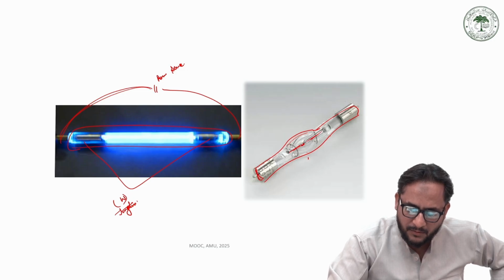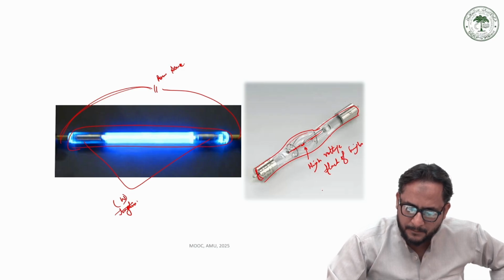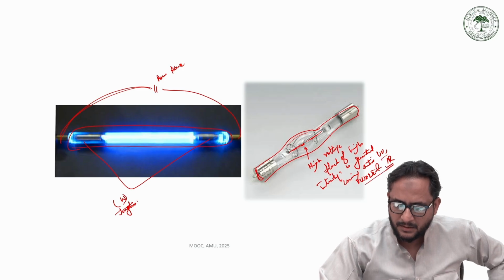Very high voltage is applied, and a flash of high intensity is generated, covering the entire UV, visible and IR regions.